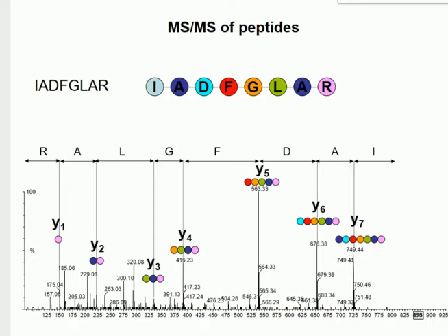So in this particular example, we're only seeing Y fragments. Now, sometimes you do see B fragments, especially when we're looking at a doubly charged precursor. Okay, one of the charges is going to be on the lysine or arginine, and one of the charges is going to be somewhere else. Now, generally speaking, the other charge will be on the N terminus. So then if you get cleavage, you are likely to have a B and a Y fragment. Does that make sense? Not really. No.